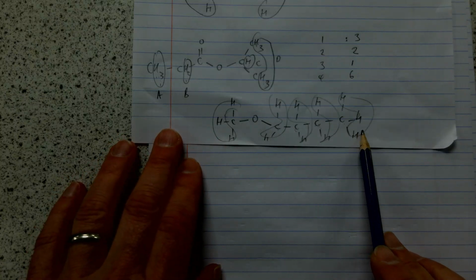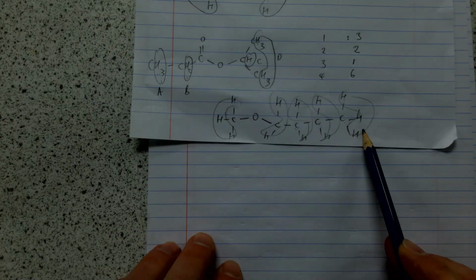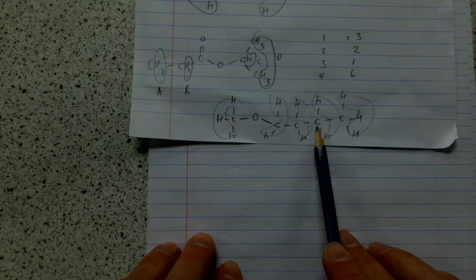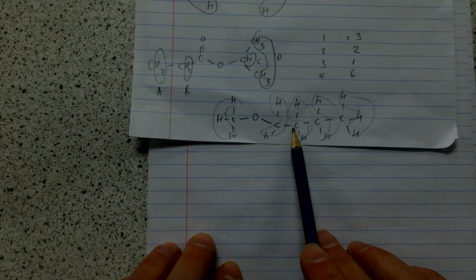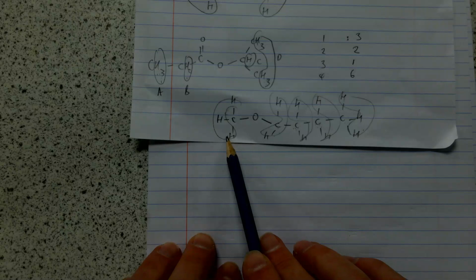Right, so let's do this one here. Shape, please. Look at the hydrogens on the adjacent carbon. That one's a triplet. That one would be a, this one would be a, this one would be a, and these 3 would be a singlet. You got it. That's it.